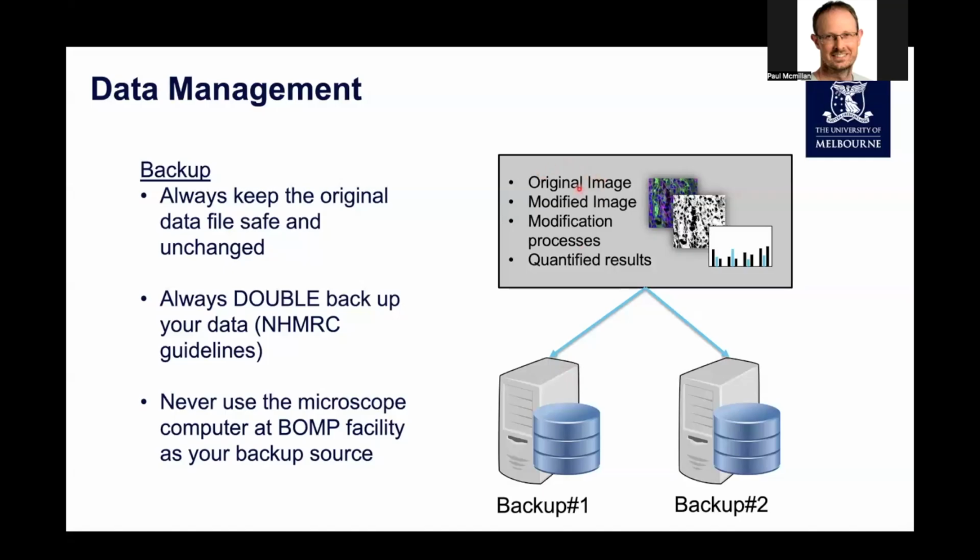So once you've got any original data modified, you've made note of your modification process, you've got quantified results, ideally we want you to double back that up. And if you're within the university, you should have access to a research drive or a MediaFlux project if you've requested one, which has that disaster recovery. So if there's a fire in the data center, the university has a backup copy of that elsewhere.